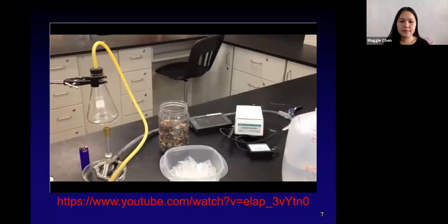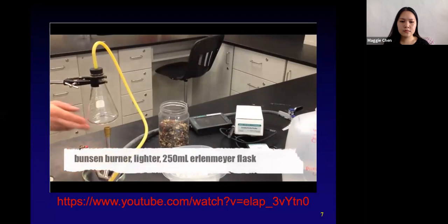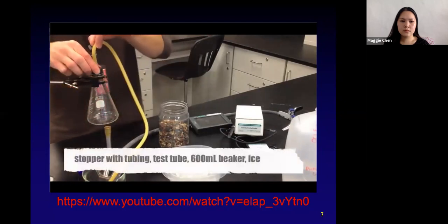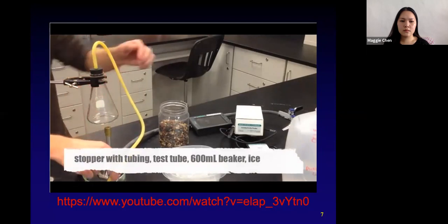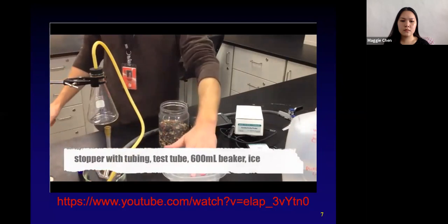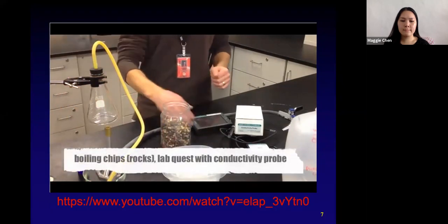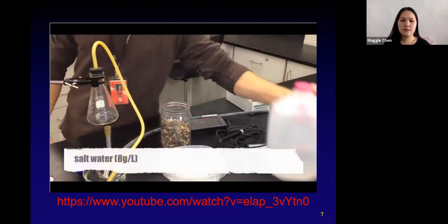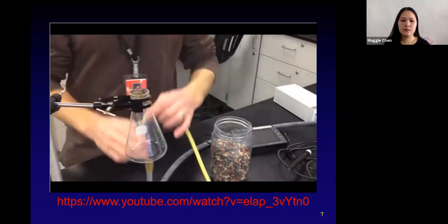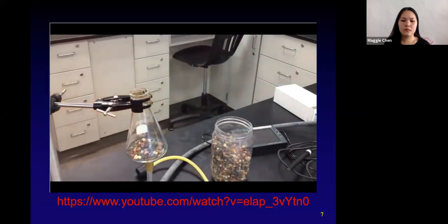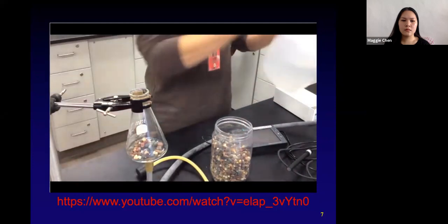The process of distillation is very energy intense. We're going to need a Bunsen burner, a lighter, a 250 mL Erlenmeyer flask with a rubber stopper and a tube to collect steam, and a test tube to condense the steam into liquid water. You'll need a 600 mL beaker, some ice, a couple of boiling chips or rocks, a LabQuest device, and a conductivity probe to measure how much salt is in the water. Of course, you'll also need salt water. To your Erlenmeyer flask, add a small handful of boiling chips — those allow the salt water to boil normally without over-boiling.